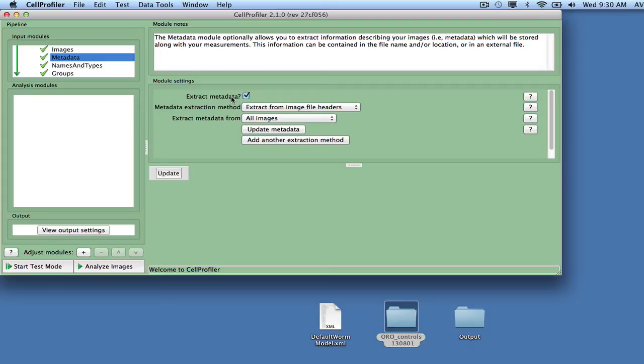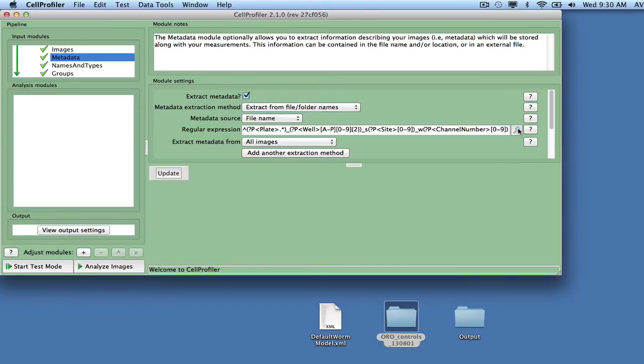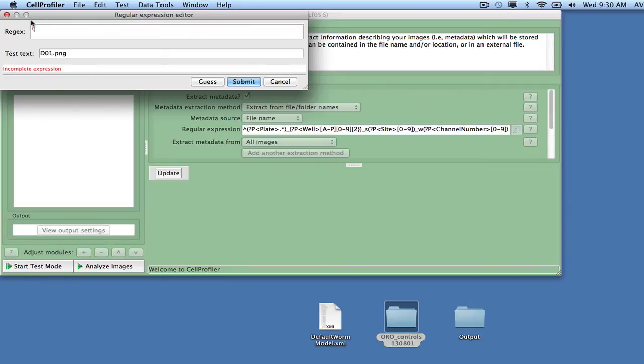Check the box Extract Metadata, and a number of options will appear underneath. Select Extract from file slash folder names as the extraction method in order to extract the well IDs from the file names using regular expressions.